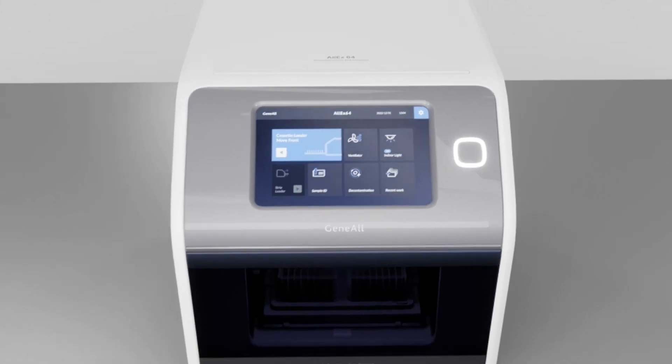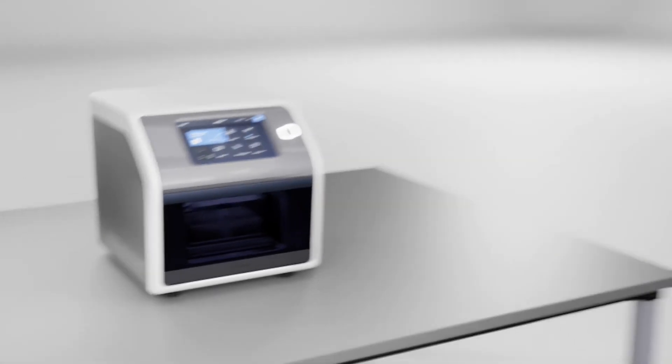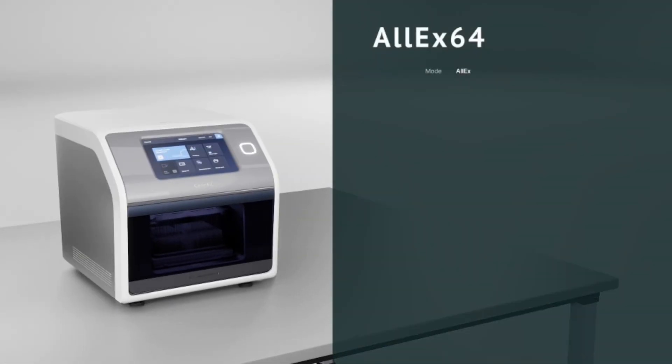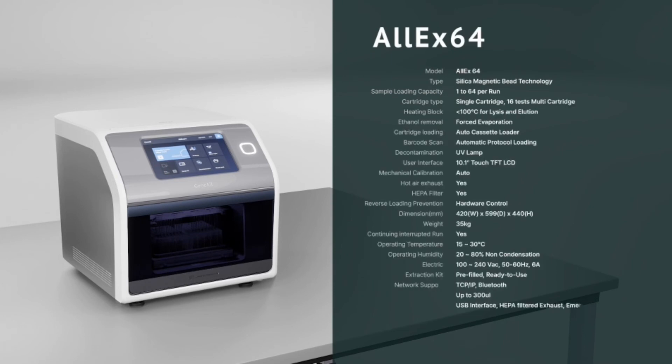Combining the innovative module arrangement to extract 64 samples in a compact design, the AllEx64 sets a new standard for fast and reproducible results in nucleic acid extraction. Designed by the experts, the AllEx64 is now ready for the experts.